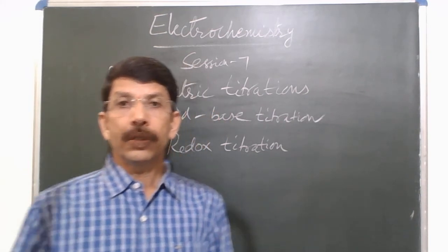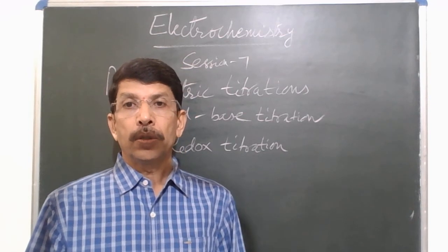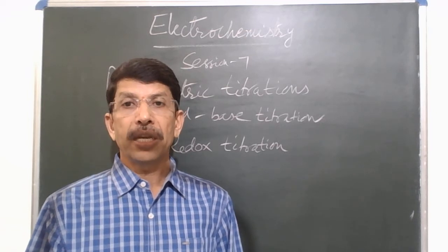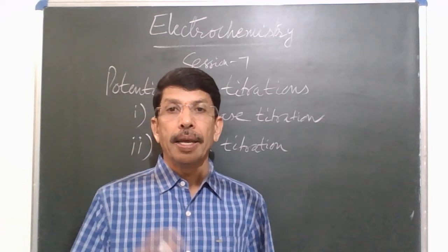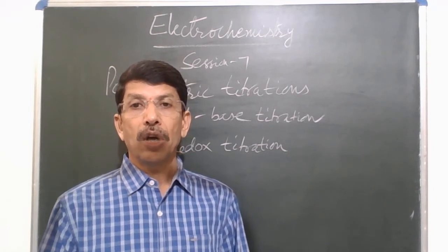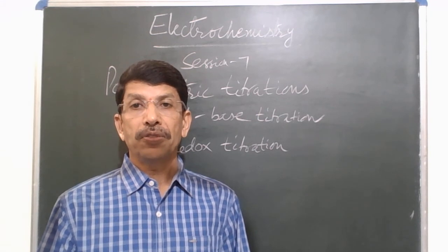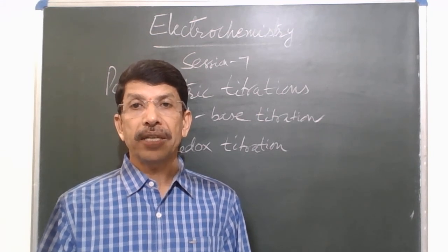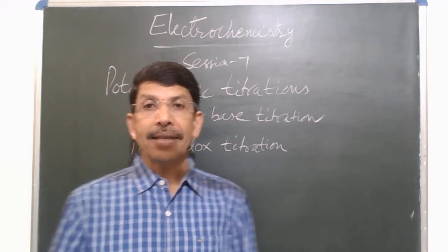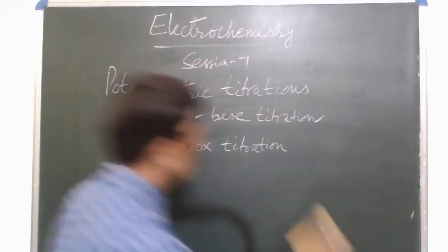In today's session, I'll be discussing potentiometric titrations. Under potentiometric titrations in the syllabus, it is mentioned acid-base titrations, redox titrations, precipitation titrations, and complexometric titrations. Out of these four different types, in this session, I will be discussing acid-base titrations and redox titrations.